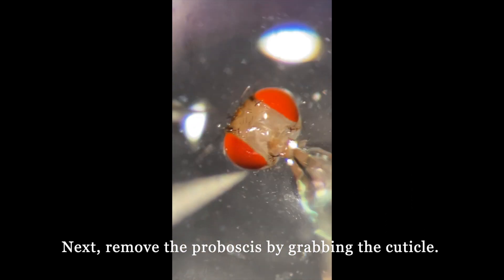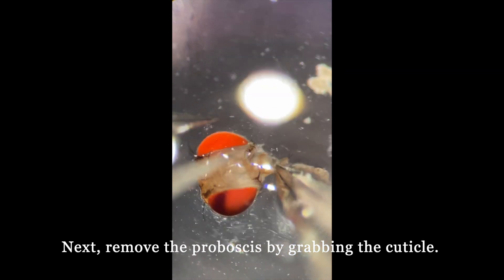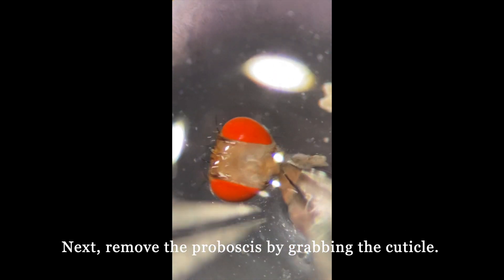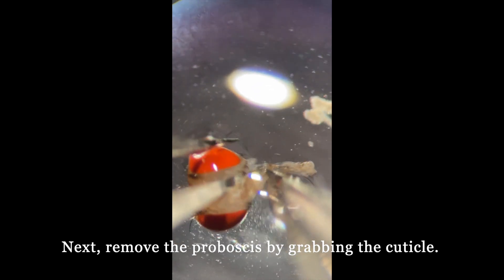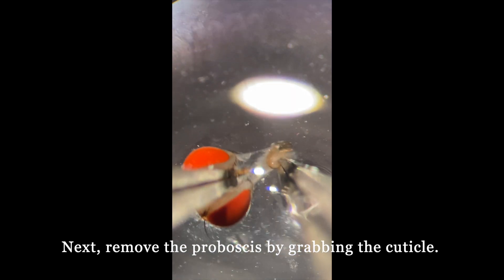Next, we remove the proboscis by grabbing the cuticles around it. You can either grab the cuticle or grab the remaining part at the back of the head from the part that we pulled off the neck.